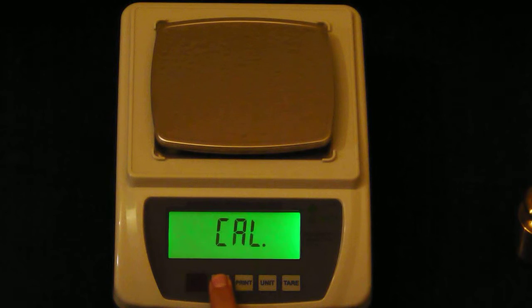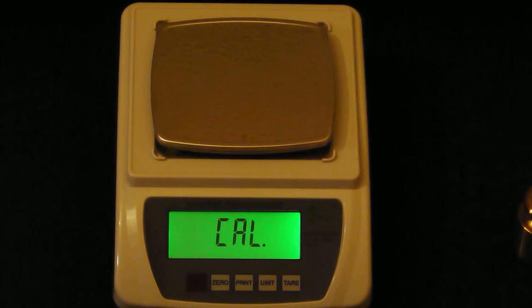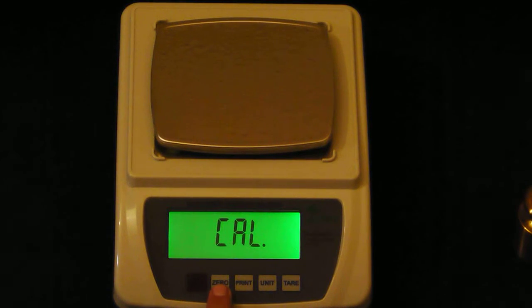Cal will come up on your display. Press 0 again and your display will show an amount and cal.